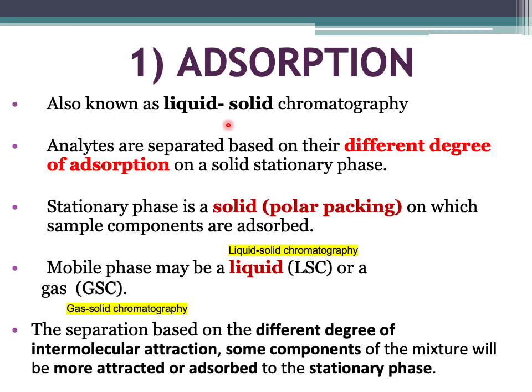Now we go to adsorption. Okay, ini analyte interaction dengan stationary phase. So bagaimana analyte tu interact dengan stationary phase by the adsorption. So also known as liquid solid chromatography. Okay, adsorption. This one we know as liquid and solid chromatography.